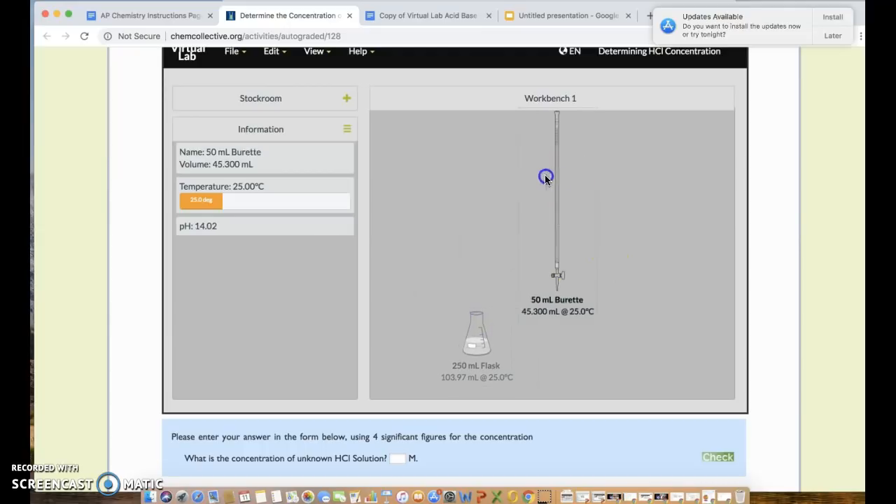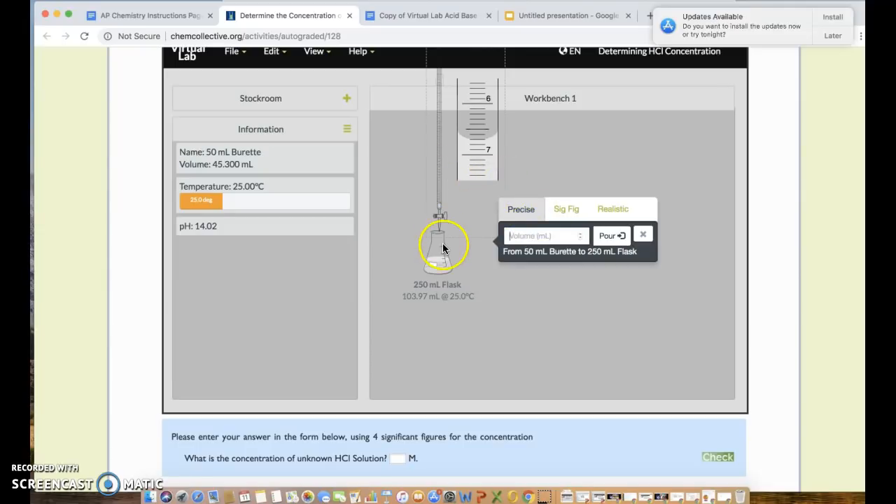To titrate, drag the burette on top of the Erlenmeyer flask and wait for the plus sign to appear. If the plus sign doesn't show, the flask may be positioned too low — move the flask higher so the burette can reach far enough down. Once the plus sign appears, the burette is on top and you can begin adding NaOH to the flask.